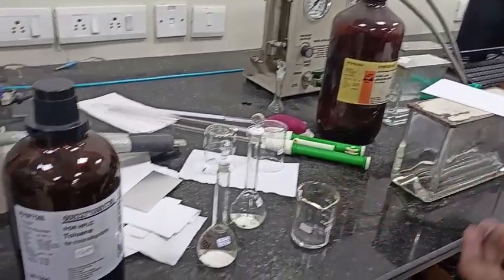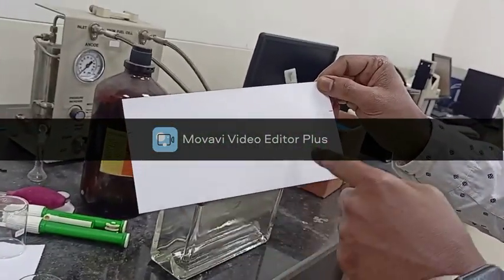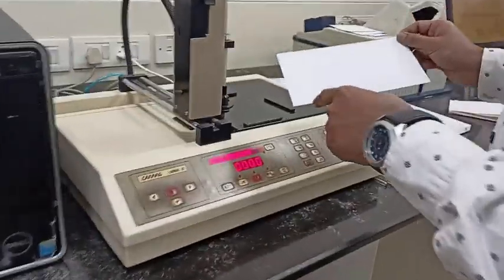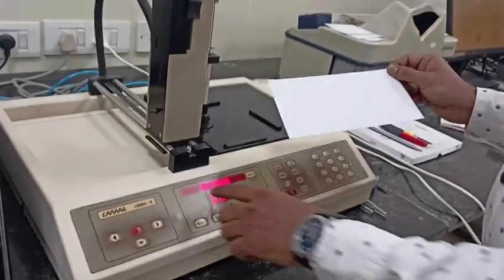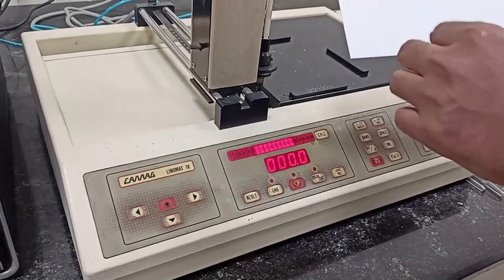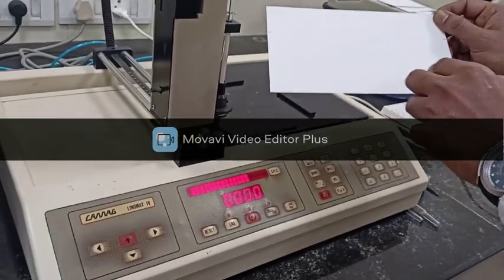Then we will prepare various bands on this TLC silica plate using this applicator. Let's say we have 15 bands. The first 6 are from benzophenone, the second 6 are from benzhydrol, and for the last 3 we will apply the sample of unknown concentration.